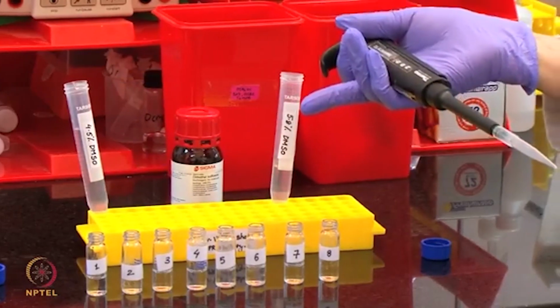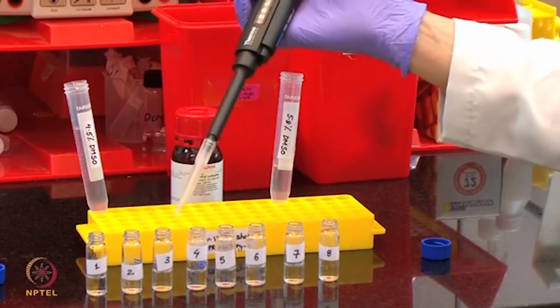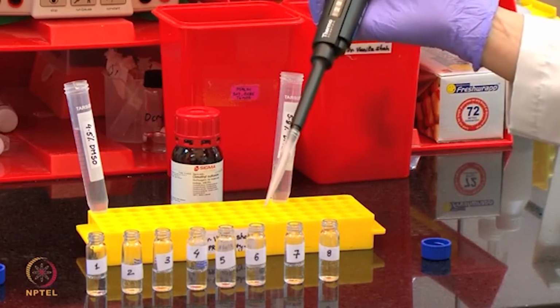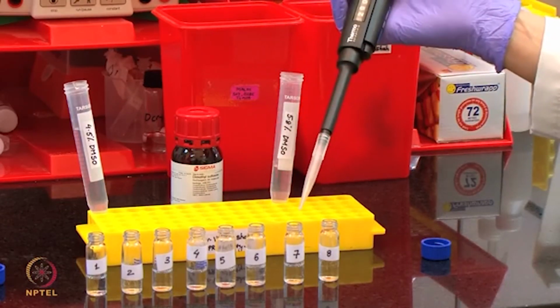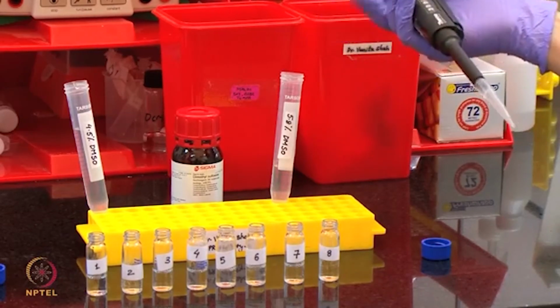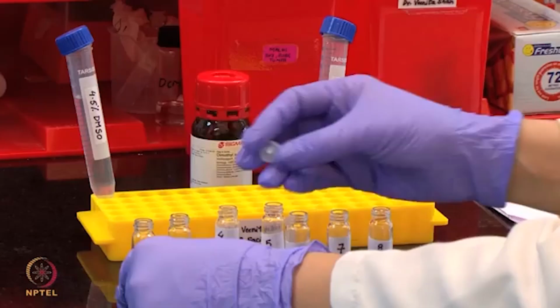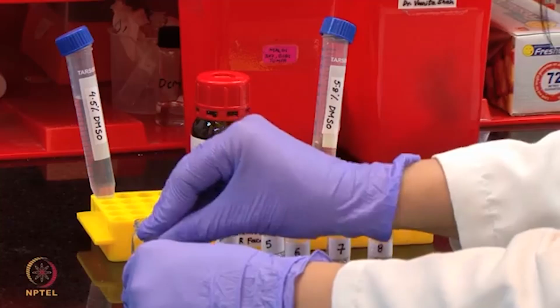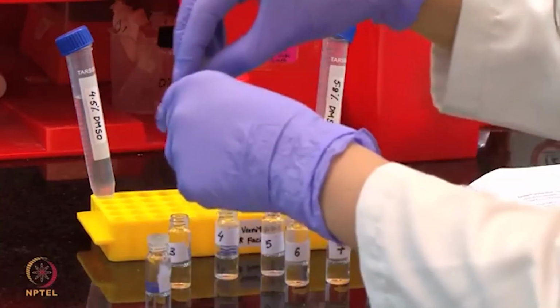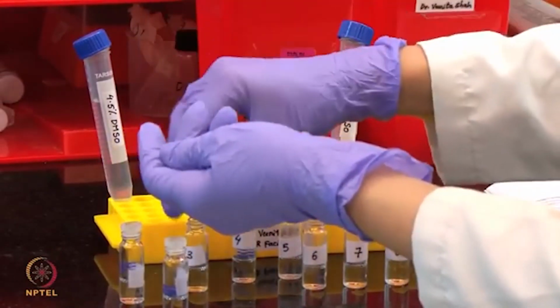Following this, we added 1400, 1200, 1000, 800, 600, 400 and 200 microliters of 5.8% DMSO in tubes 1 to 7 respectively. We will mix these solutions vigorously and put the lids on and keep them in dark till we are ready with all the other samples.